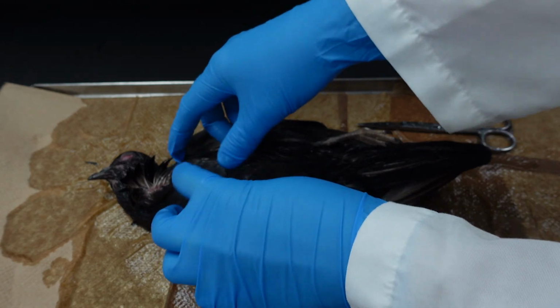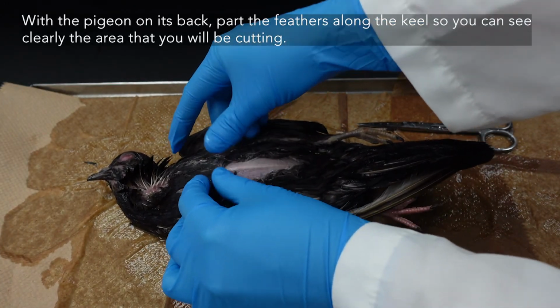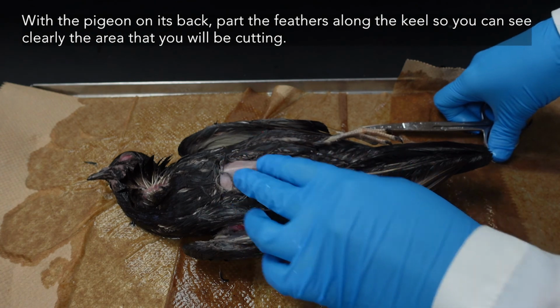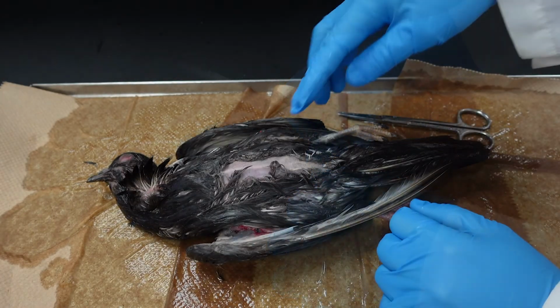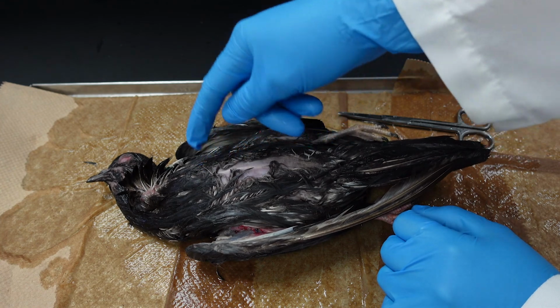So turn your pigeon so it's belly up. Part the feathers so you can see the keel. Birds are feathered in tracks, so there are some parts of a bird that do not actually have any feathers coming out of them. That just gets covered over by feathers on other parts of the body, which is kind of cool.